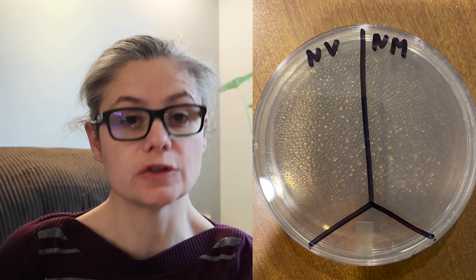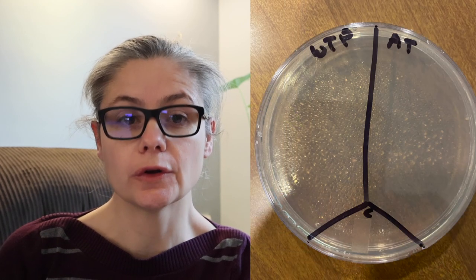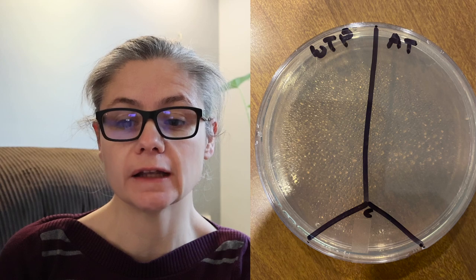Results after cleaning the wall before we started any testing. So near the vanity and near the mirror, there was no bacteria growing on the walls. The wall with the toilet paper roll and above the towel rack, again, there's no bacteria growing. And behind the toilet and the wall next to the toilet has no bacteria growing. So this is great. This is exactly what we want. We want clean walls with no bacteria growing on them as we start this test.